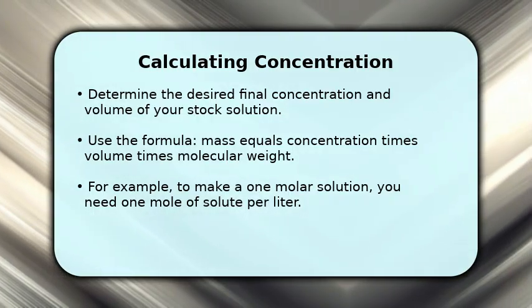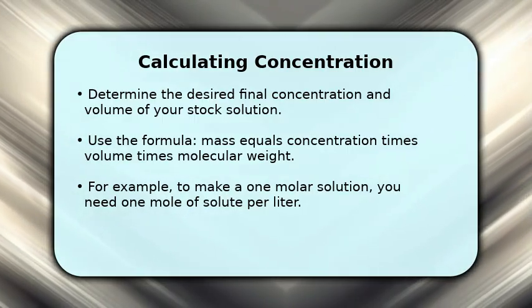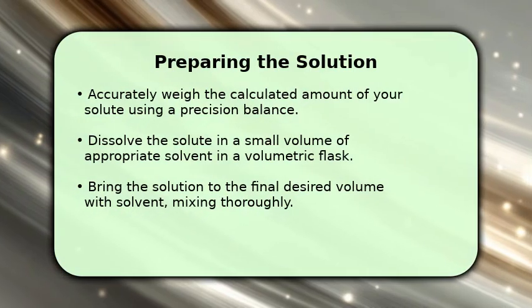For instance, if you aim for a 1 molar solution, you'll need 1 mole of the substance dissolved in 1 liter of solvent. Now, let's prepare it.